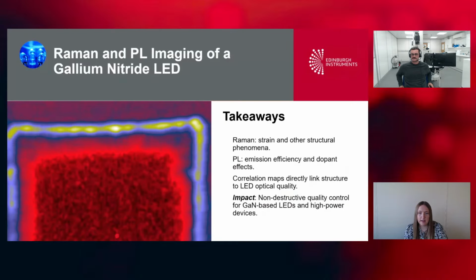And in this case, you've used different objectives between the photoluminescence measurements and the Raman measurements. Can we still say that those are truly correlative, or what could we have changed to make sure that they were truly overlapping in spatial resolution?